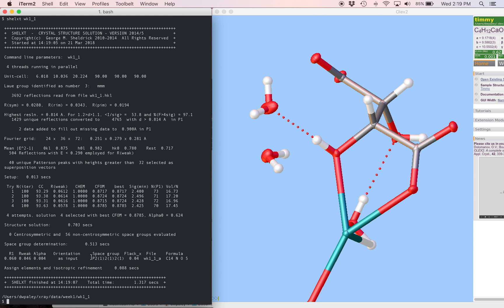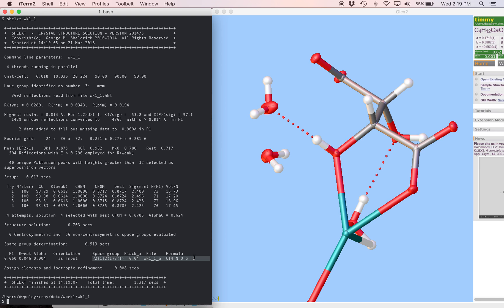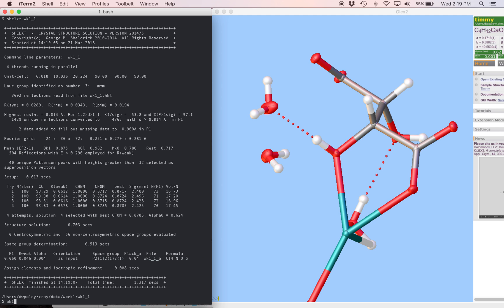One important thing to notice about this is you're going to get a solution in every possible space group, or every space group that ShellXT considers possible for the structure. There's only one possibility in this example, and it's the one that we already know is correct, P212121. So we get that output under the name week1_1_a.res.